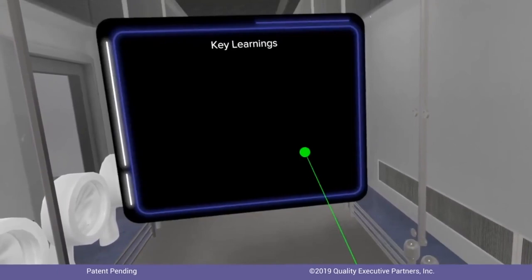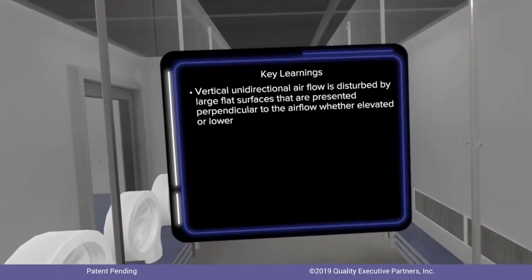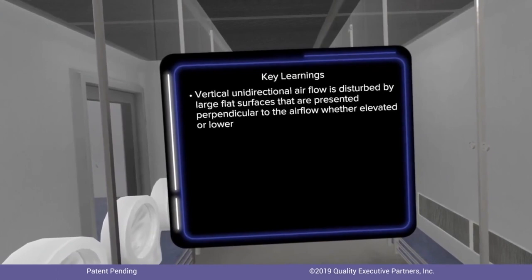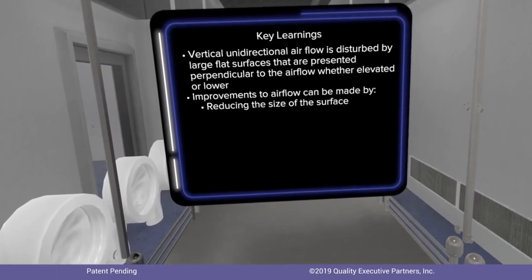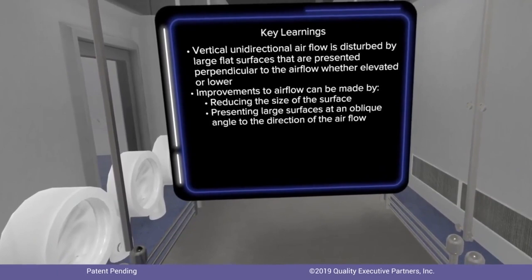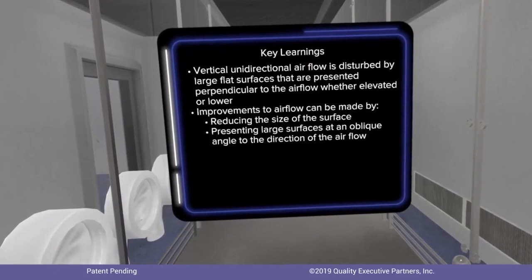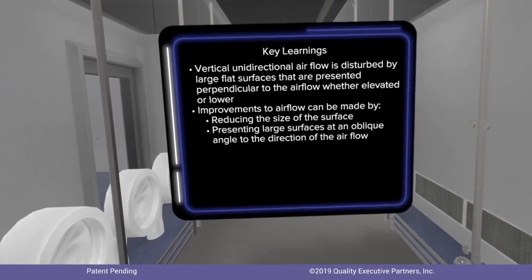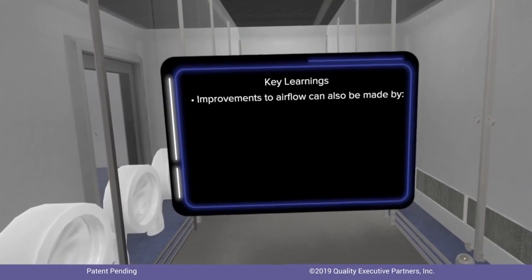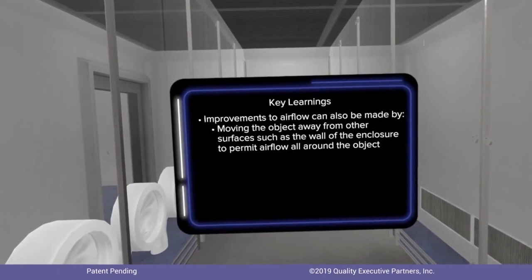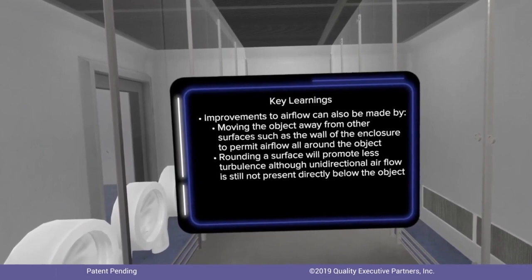Key learnings from this immersive: Vertical unidirectional airflow is disturbed by large flat surfaces presented perpendicular to the airflow. Improvements can be made by reducing the size of the surface, thereby disrupting a smaller amount of overall airflow. Improvements can also be made by presenting large surfaces at an oblique angle to the airflow direction — such as when the cube was presented on edge, creating sloped rather than flat surfaces to the airstream. Perforating the surface to permit air to move through the object can also improve airflow, though perforated surfaces present cleaning challenges. Moving the object away from other surfaces like the enclosure wall, and rounding a surface, will also promote less turbulence.